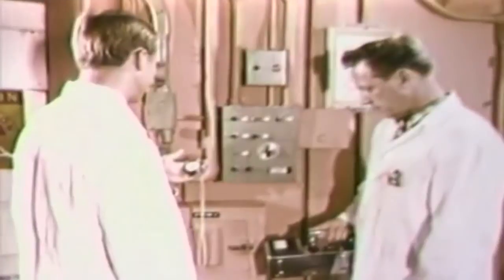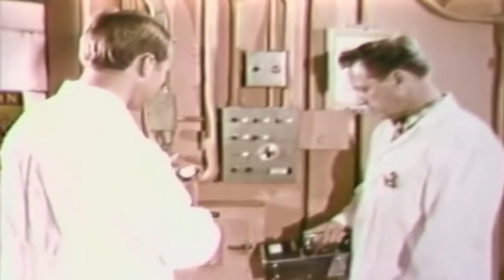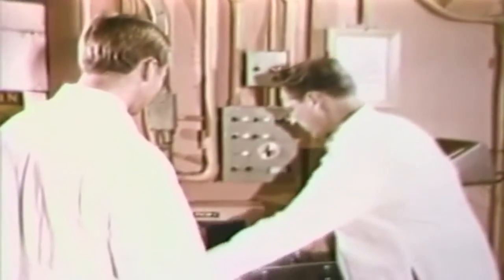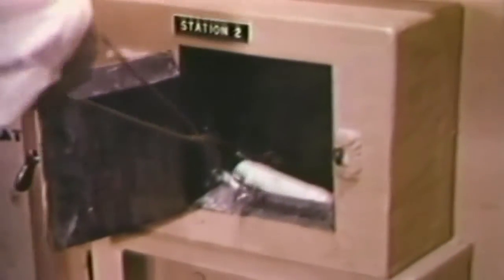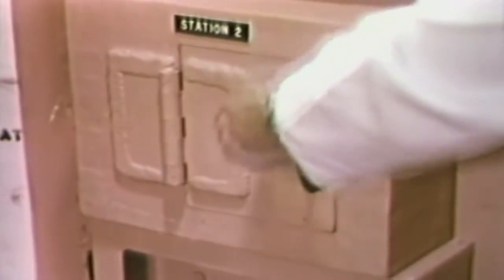After being exposed to the neutrons at the core of the reactor for a predetermined time, the rabbit with its now radioactive samples is returned. The health physicist monitors the radiation level before it is withdrawn. The samples will be transferred to a lead container, labeled and hand-carried by the examiner back to the FBI laboratory.